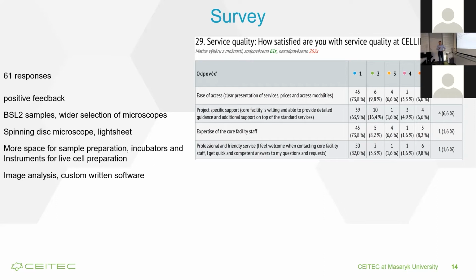Our microscopy laboratory can handle BSL2 samples, but we have to book all the other systems, so there can be only this one user at present at one time. And ELIRA, the super resolution microscope, is for the moment not able to operate in a BSL2 regime. We are solving this issue, and it might be possible in future.